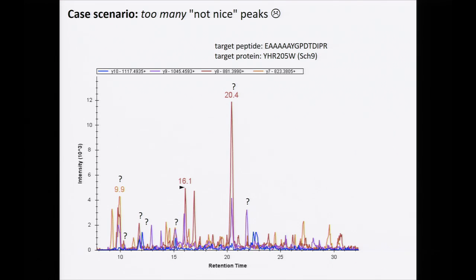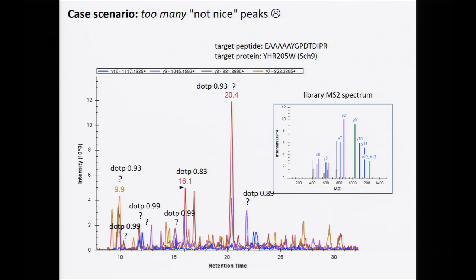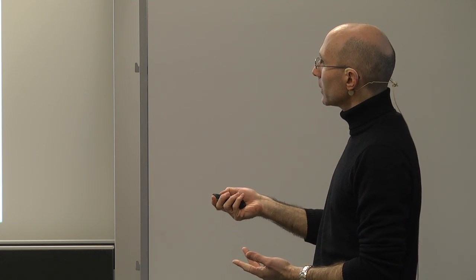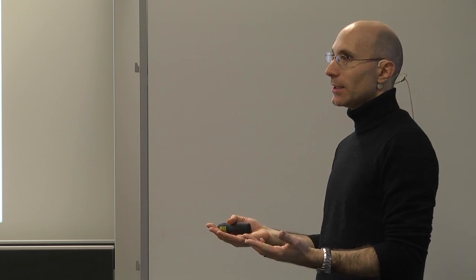Sometimes it gets really more tricky, and even the dot product doesn't tell you very much. You can probably reject very low dot product peaks, but when you have three peaks all with about 0.99 dot product, it becomes very hard to tell them apart even with known library spectra in the background. This is the case of a peptide in a light background.